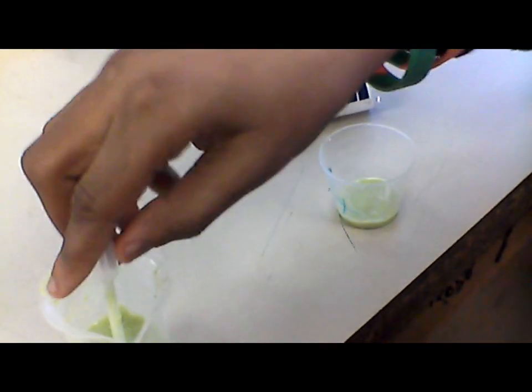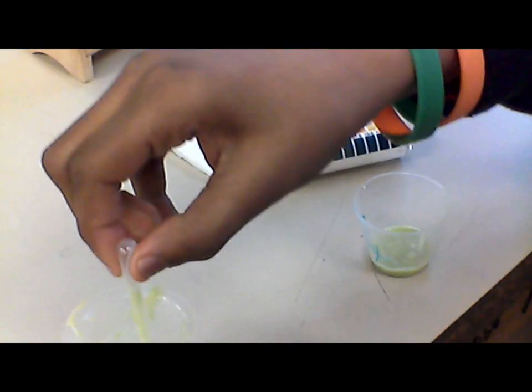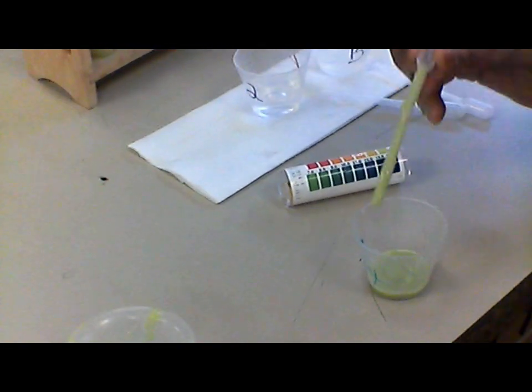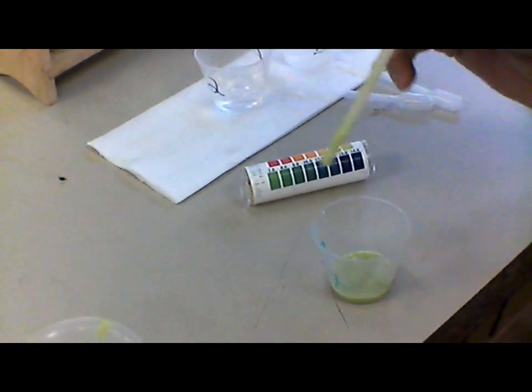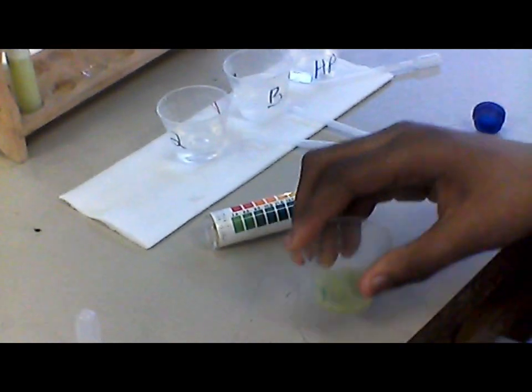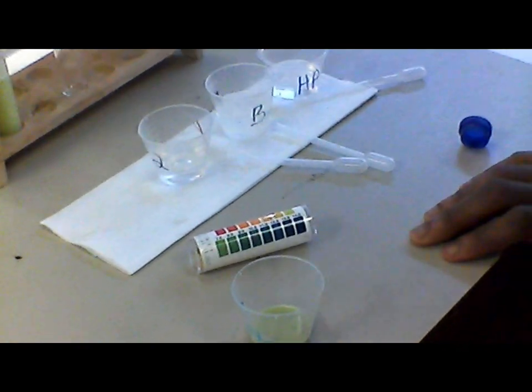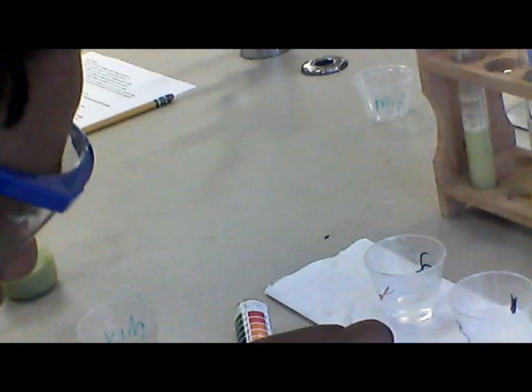Almost. I gotta get to the line. Alright, 5 cc's. Take 10 drops of vinegar into that cup. Which one's vinegar? I think it is this one. Yeah.